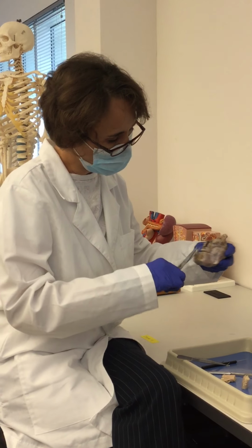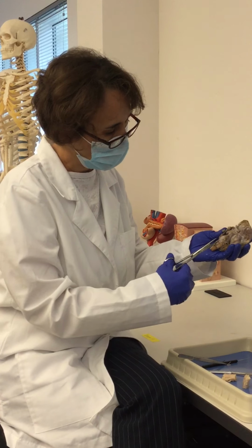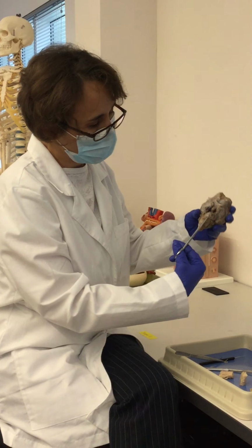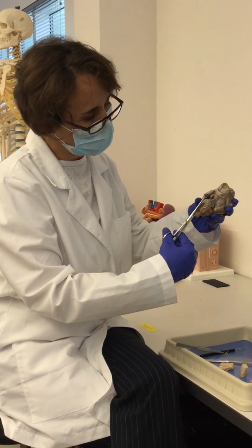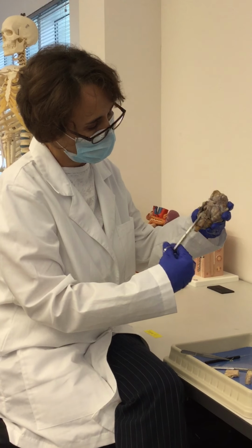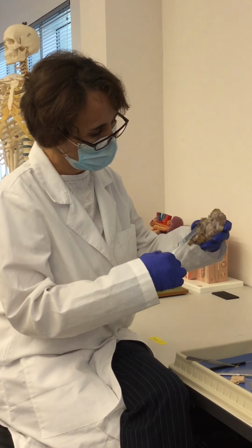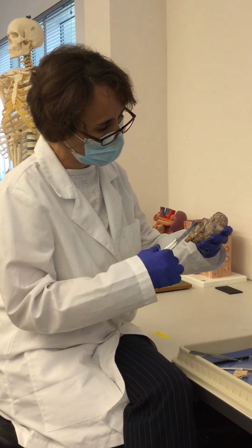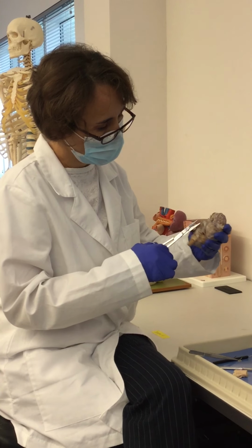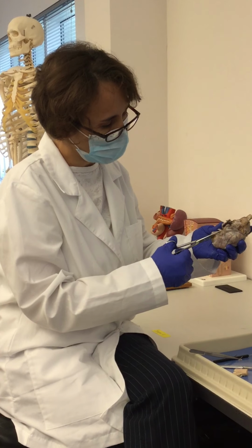Then I start here on the inferior portion of the brain, and just put the tip of the scissors underneath the dura mater, doing a mid-sagittal incision. Be careful not to go deep, to not damage the internal structures of the brain.